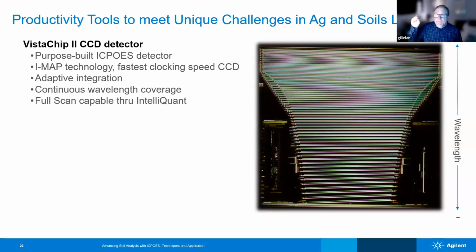This shape is part of the Echelle optical system. The whole system is built around this. And if you can see in the detector, you'll see rows, those silvery looking rows that are kind of at an angle. Those are rows of pixels, and they are actually built specifically for the spectrometer.